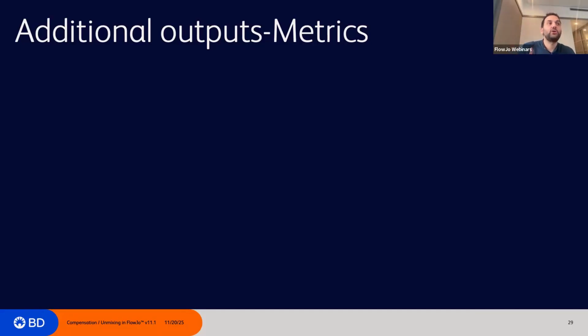So you keep two additional channels, so it doesn't make any difference. You can use multiple autofluorescence signatures, keep additional channels open, assign it to the most autofluorescent detector, and then unmix the data. So it is possible. I hope I got it right and I answered you right. If this can be done in FlowJo version 10 as well, yes, it can be done in version 10 as well.